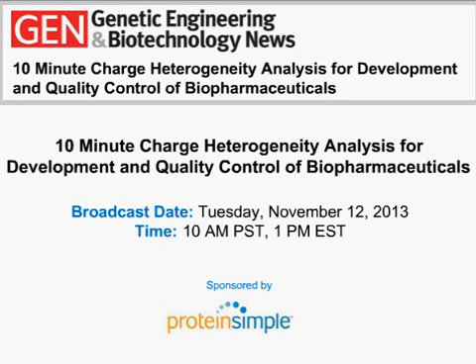Carrie Anderson is Senior Scientist in Vaccine Analytical Development at Merck Co. Carrie will talk about application of imaged capillary isoelectric focusing, or ICIEF, in vaccine and biopharmaceutical protein-based products. Karan Shah is Senior Research Associate 3 in Analytical and Pharmaceutical Sciences at Immunogen. Karan will describe the analysis of maytansinoid antibody-drug conjugates by ICIEF.